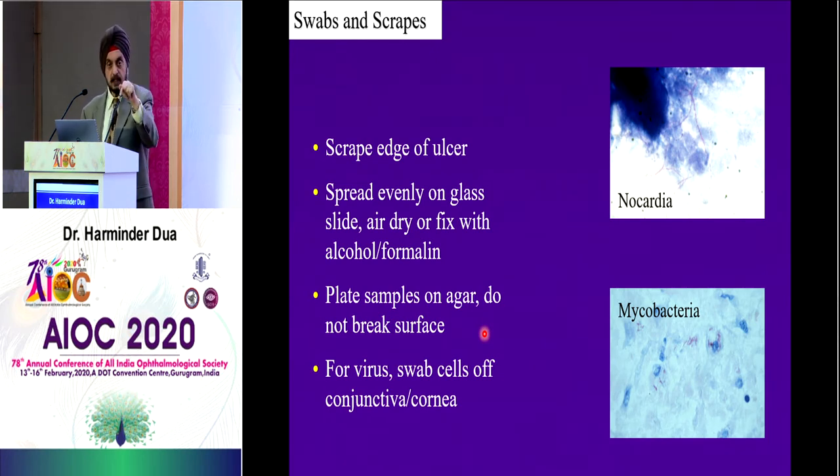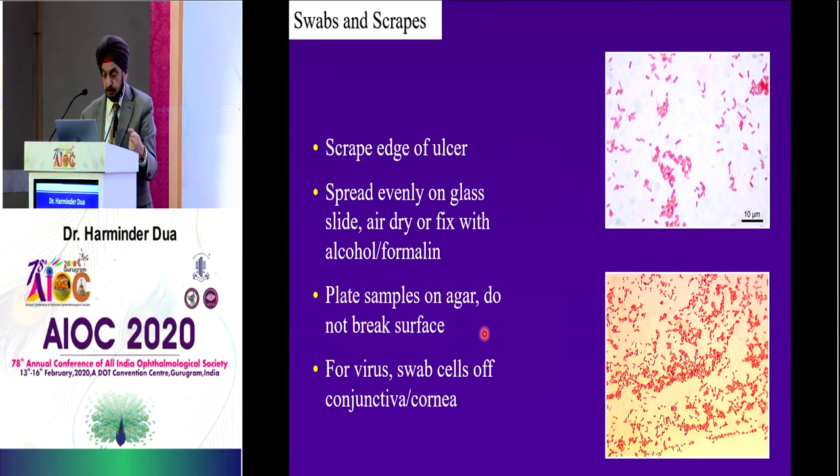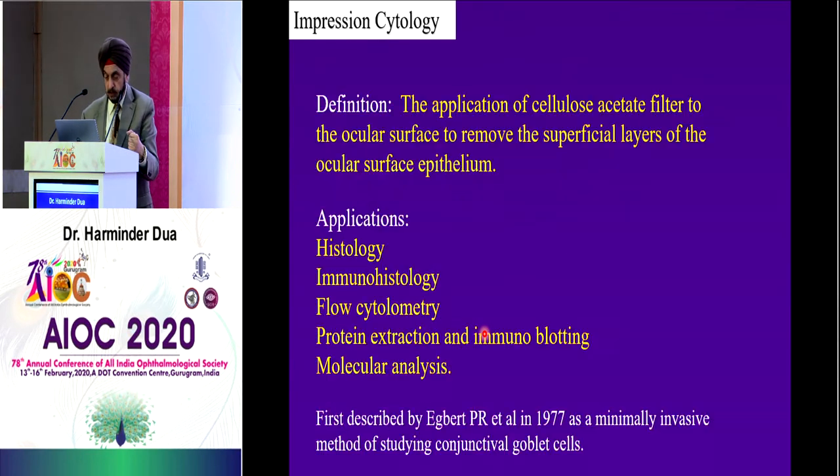And you never break the surface. The bacteria grow on the agar plate and give you the morphology of the colony. If you break the surface and it's in the agar, you're going to lose that completely. So it is very important not to. And you can make a vigorous swab of the cells in case you're looking for virus, because you need the cells, as viruses are intracellular. These are some of those examples.